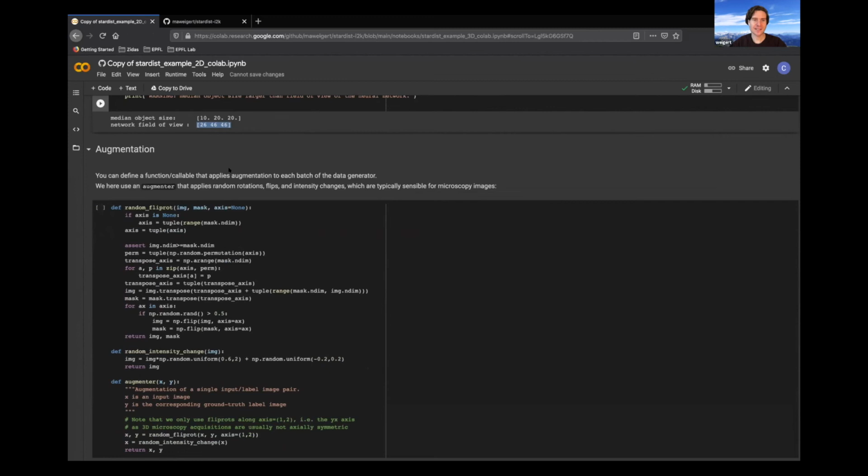The next step is that although we have 27 stacks, it's always good to do some basic augmentations that I already mentioned in the main overview lecture. And these are, yes. Just a quick question.